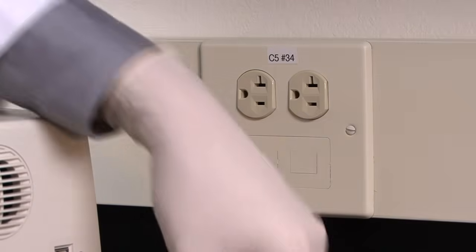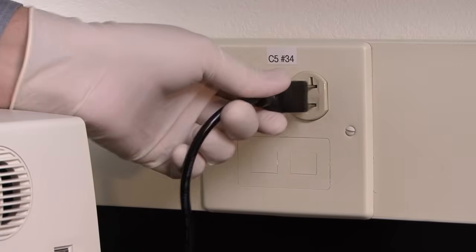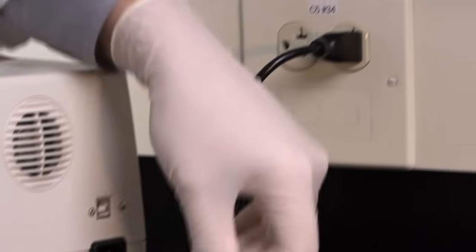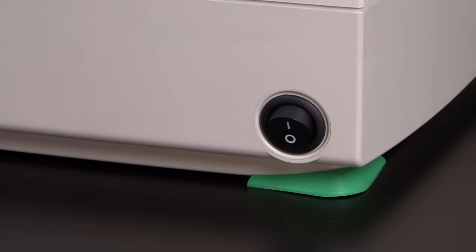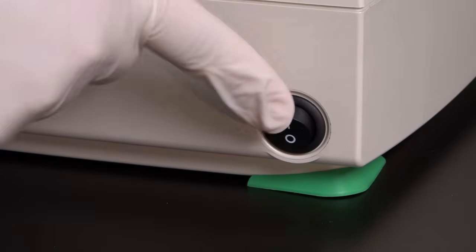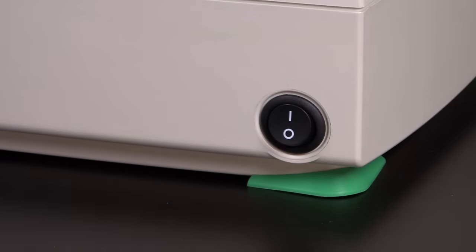In order to set up the transblot turbo, simply plug in the power cord included with the system to the rear of the unit. The power supply is compatible with universal line voltage. Turn on the power switch located at the side of the unit and you are now ready to assemble a transfer sandwich.